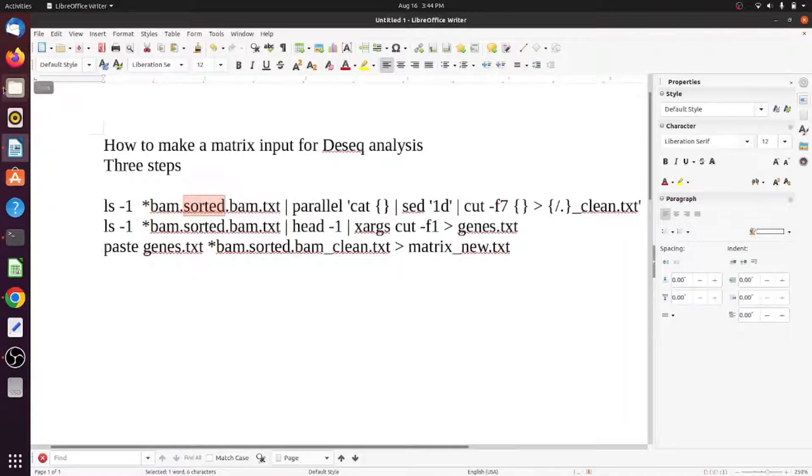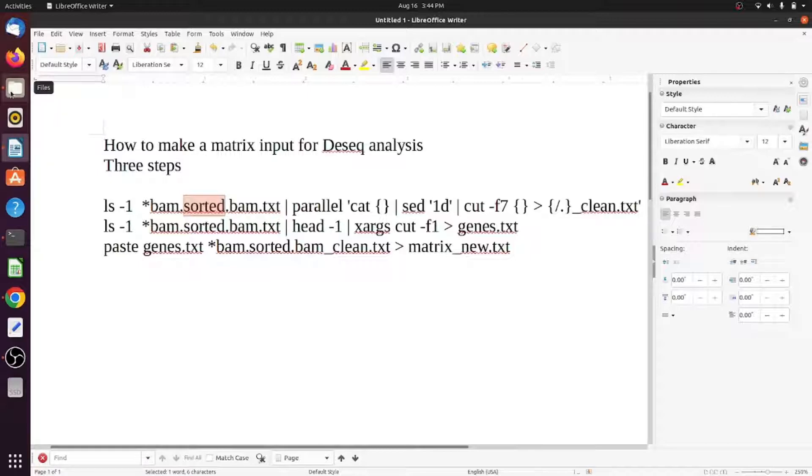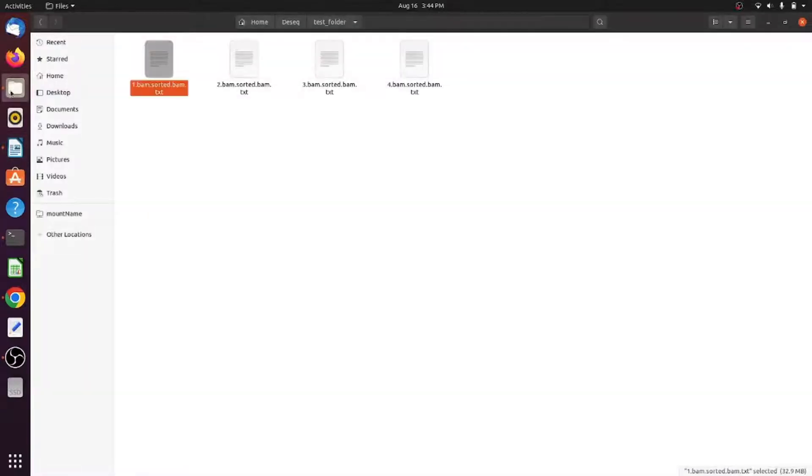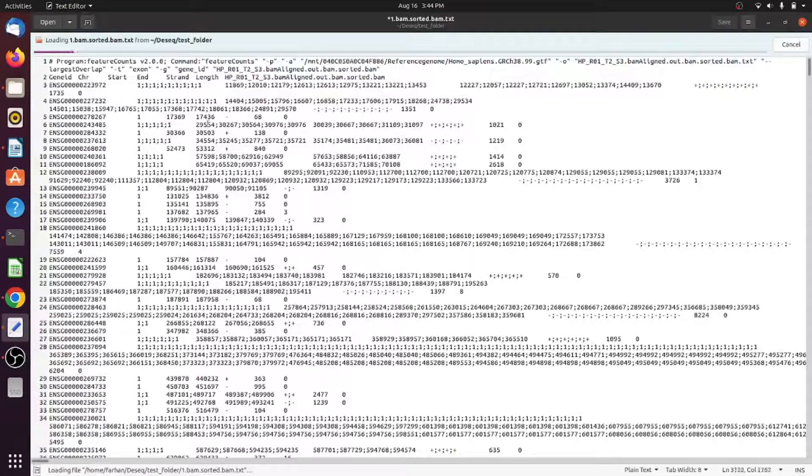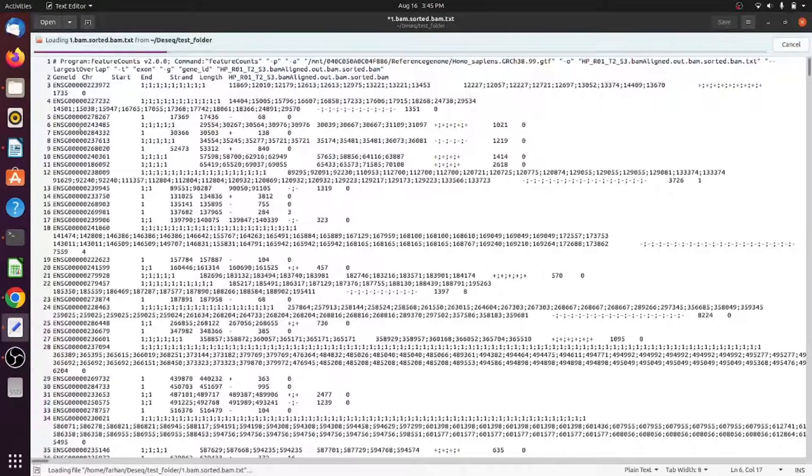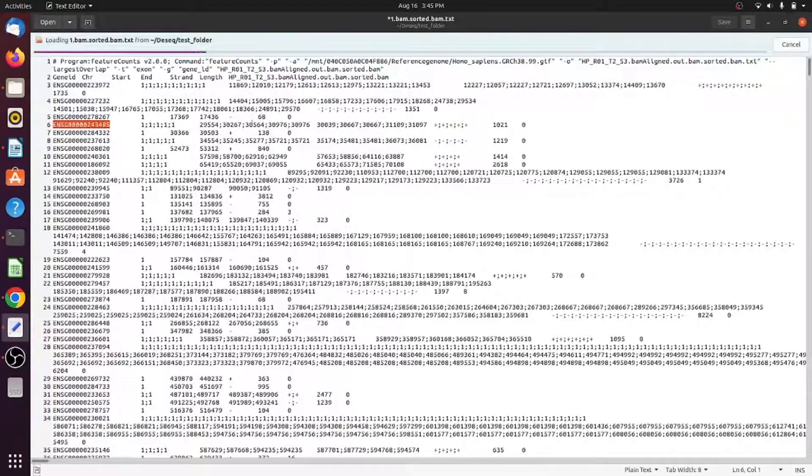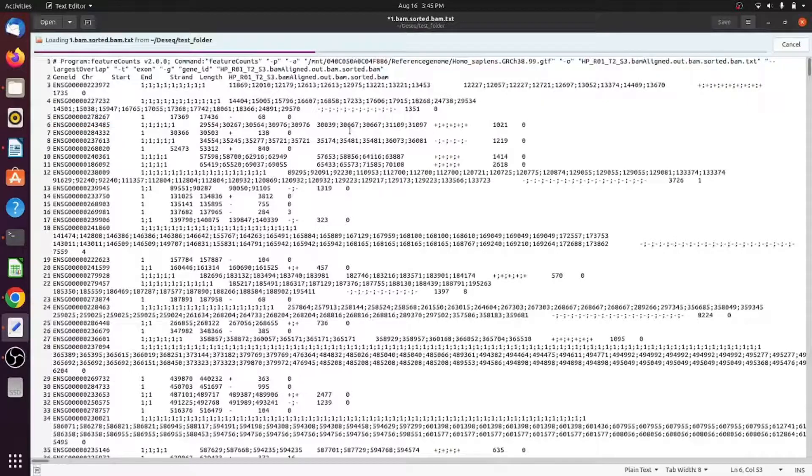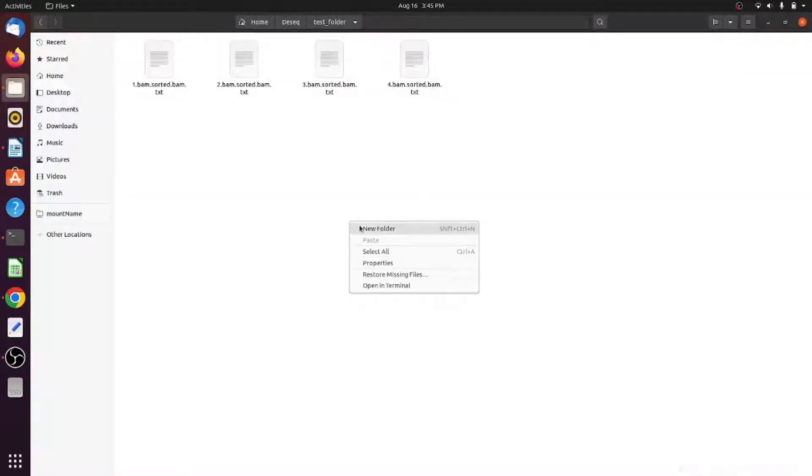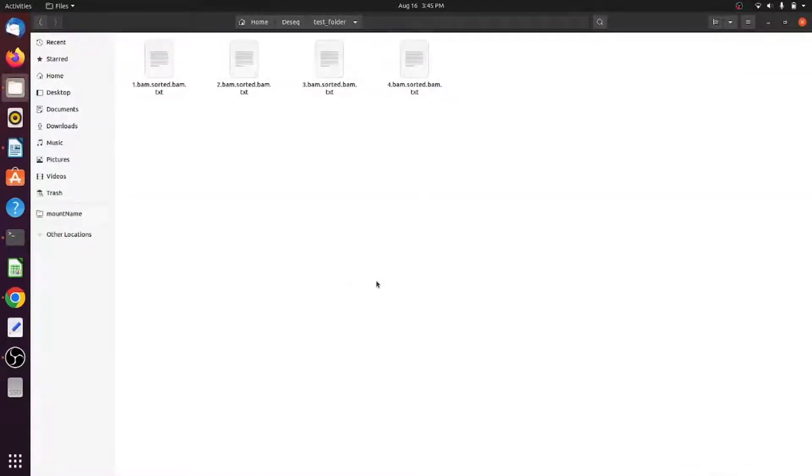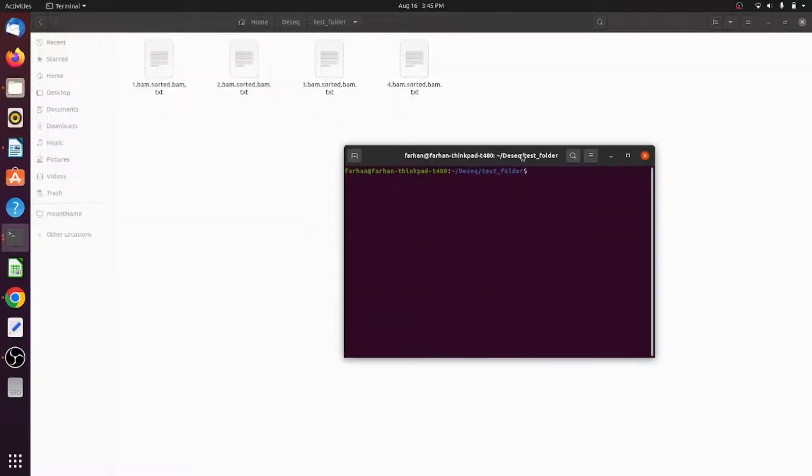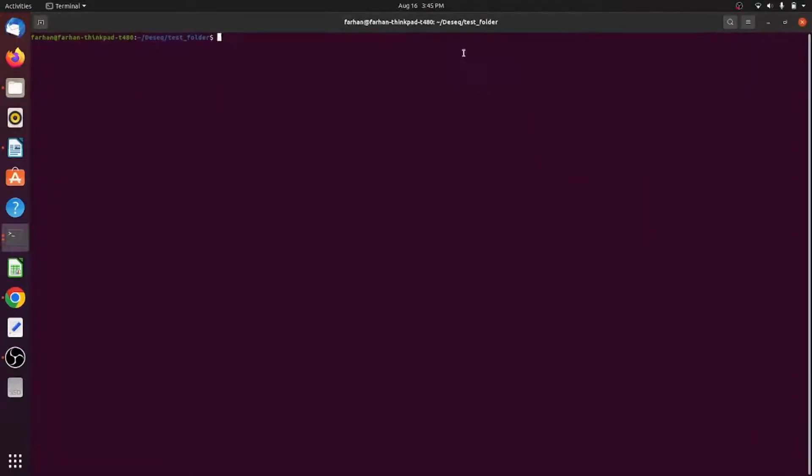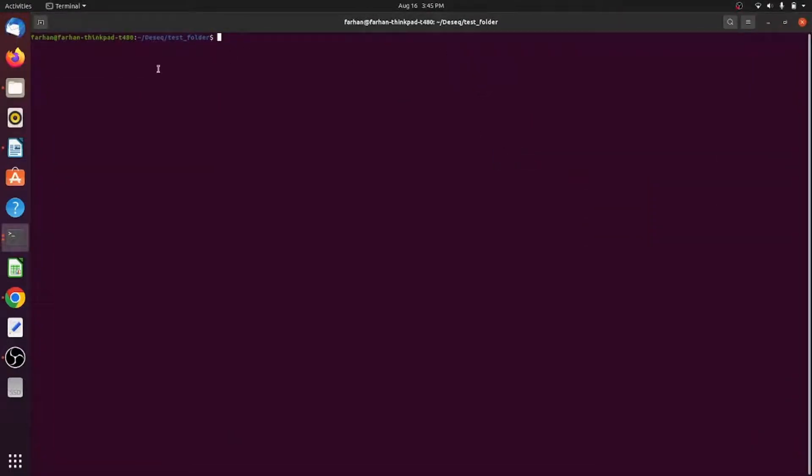I'll show you one by one. One command is to make the clean output, then to extract the genes, and then combine the clean output and the gene names. Clean output means there are a lot of different values which you don't need - you just need the feature counts.